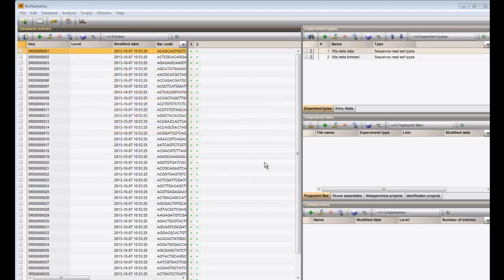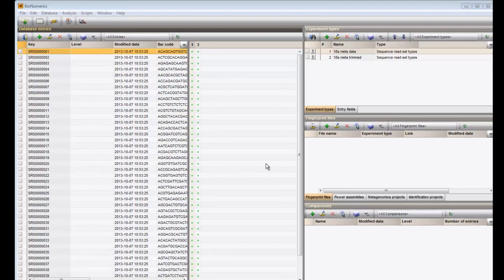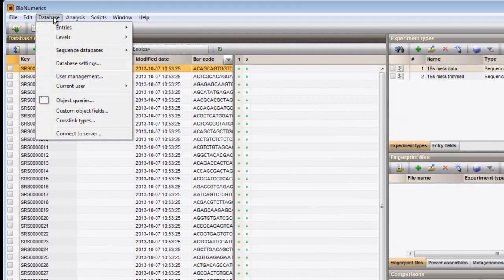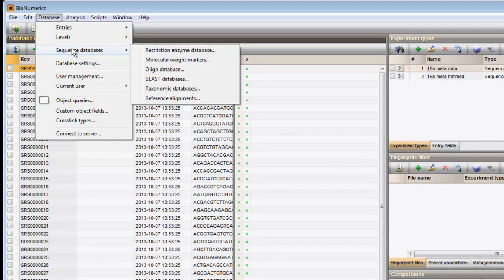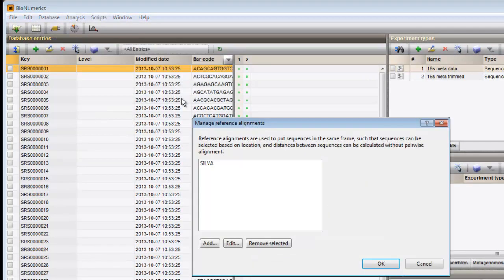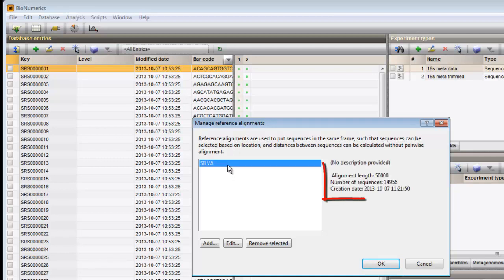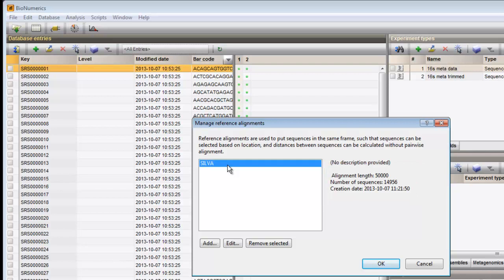First, we can check the presence of the uploaded reference alignment. I select database, sequence databases, reference alignments. When selecting one of the loaded reference alignments, detailed information including the alignment length and the number of sequences is displayed at the right.